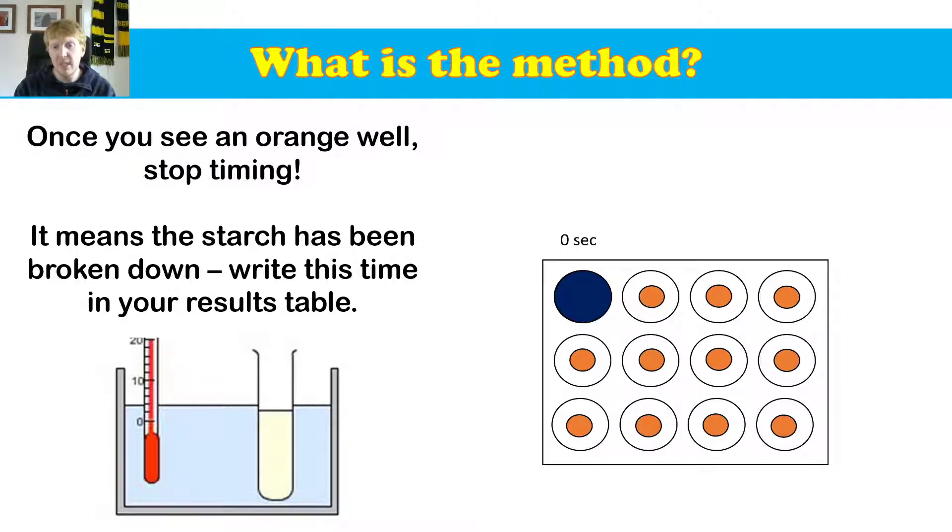And so now we're going to mix the amylase with it. And in 30 seconds time, what we're going to do is we're going to take another drop out of it and pop it there. And we can see it's starting to get a little bit lighter, which means the starch is being broken down.